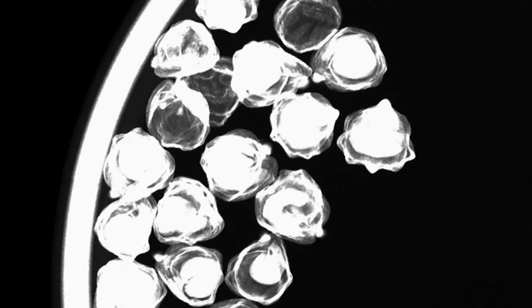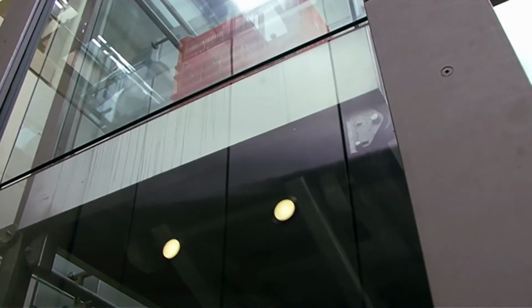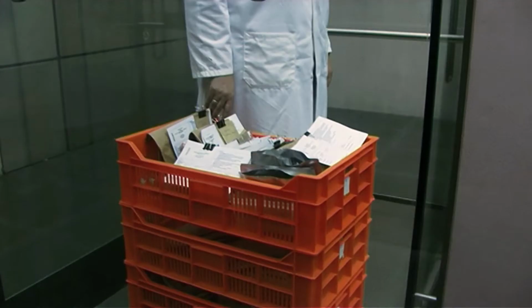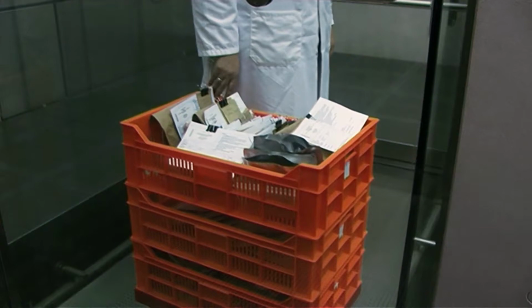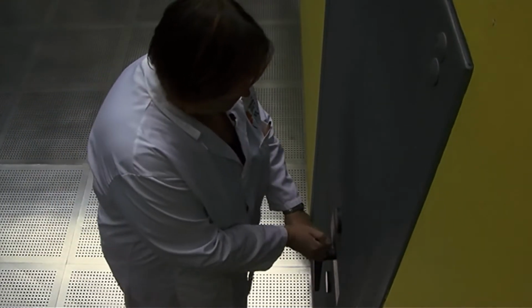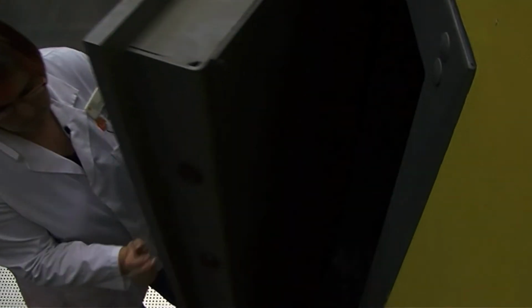During cleaning, the seeds were exposed to air containing moisture, so they must be dried out again before being finally stored. So our clean collections go downstairs into the dry room, which is adjacent to our seed storage vaults, and the final drying stage is completed.